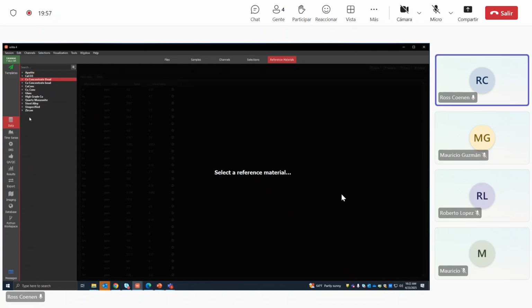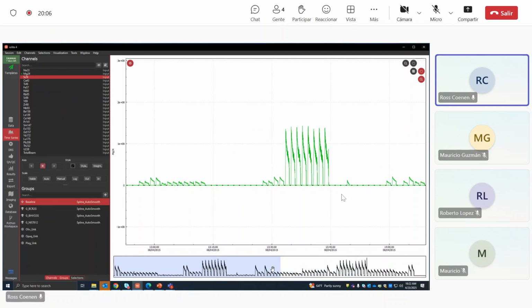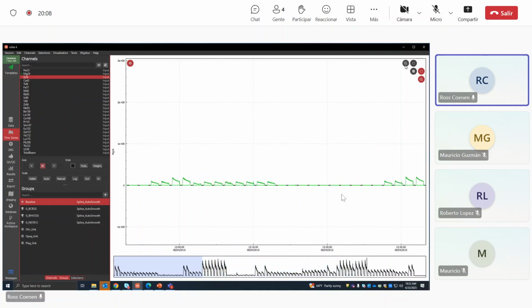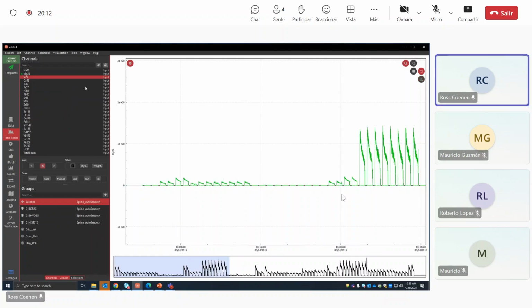So now we'll start moving over here to the left, down to time series where we were just in. And in here, we can look at all the different elements and just visualize the signal. Right now, we're plotting magnesium.